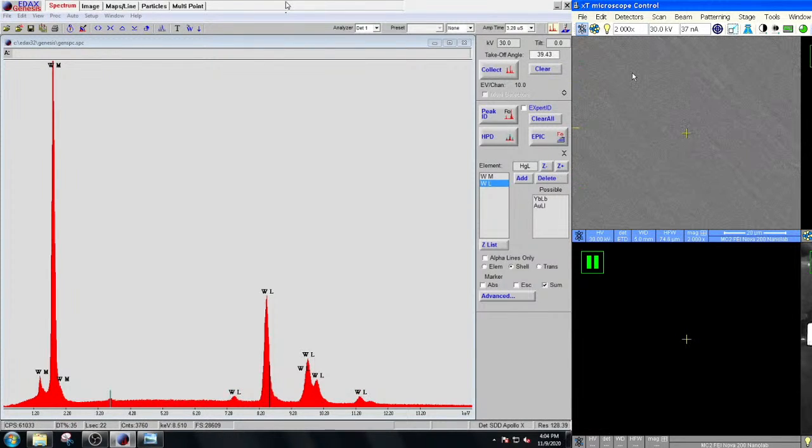Okay, so we were talking about dead time. The dead time is the ratio between the live counting and the analyzing. So let's say the detector has to hypothetically stay open for 1 second, and then an X-ray photon comes in, and the detector will turn itself off and then measure the energy of that photon. And let's say it takes a tenth of a second to measure the energy of the photon, then the dead time would be the tenth of a second divided by the 1 second, which I guess is like 10%?